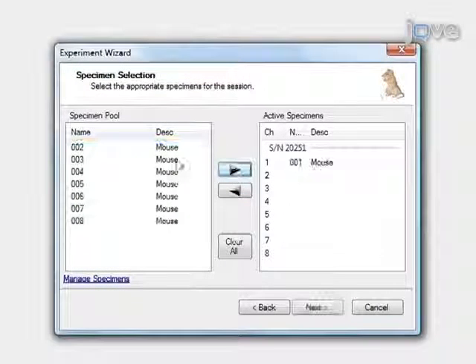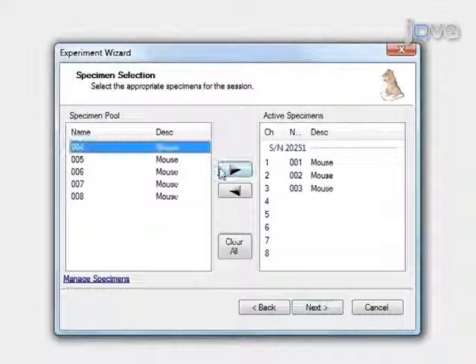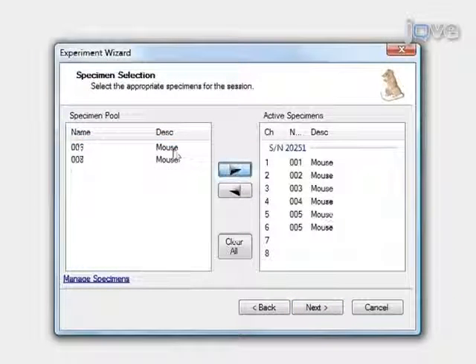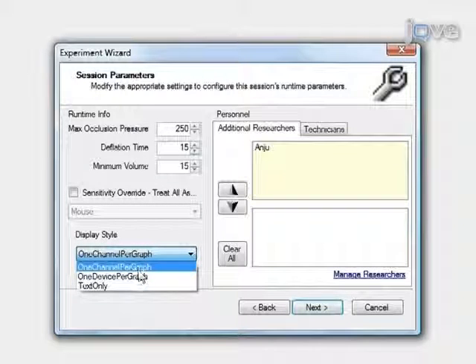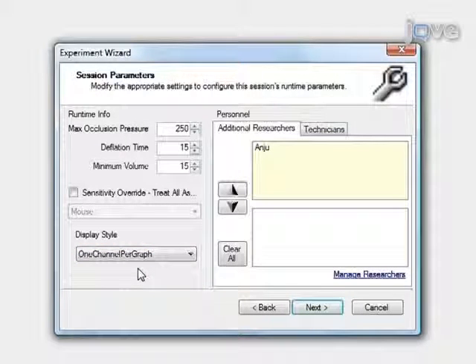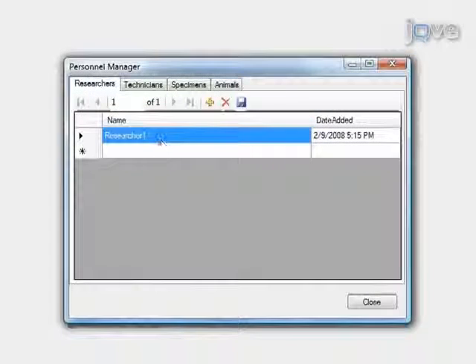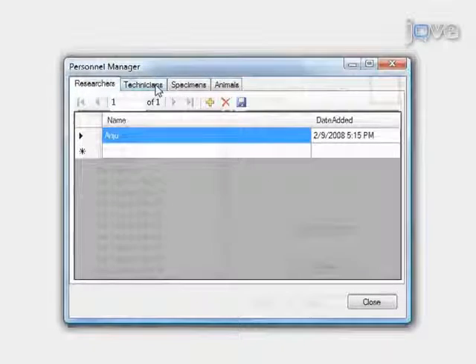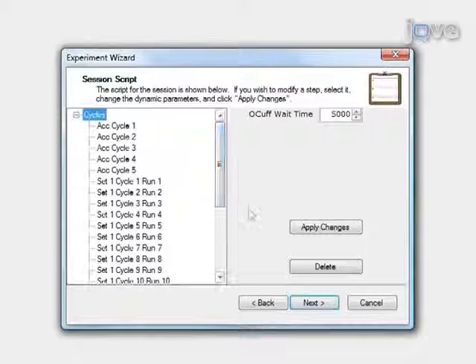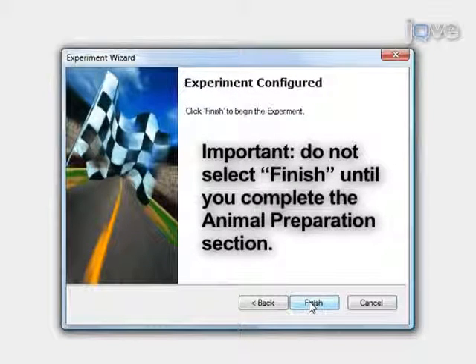To begin specimen selection, select the specimen from the specimen pool and assign it to the first available channel and click Next. To set session parameters, set maximum occlusion pressure to 250 millimeters mercury, deflation time to 20 seconds for mice, minimum volume to 15 microliters, and display style to 1 channel per graph. You may also add additional researchers and technicians, then click Next. Review the session script and click Next. Do not select Finish until you complete the animal preparation section, which is described next.